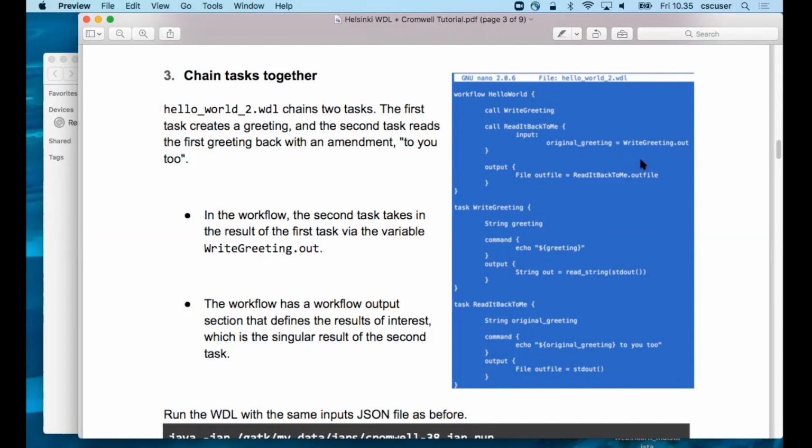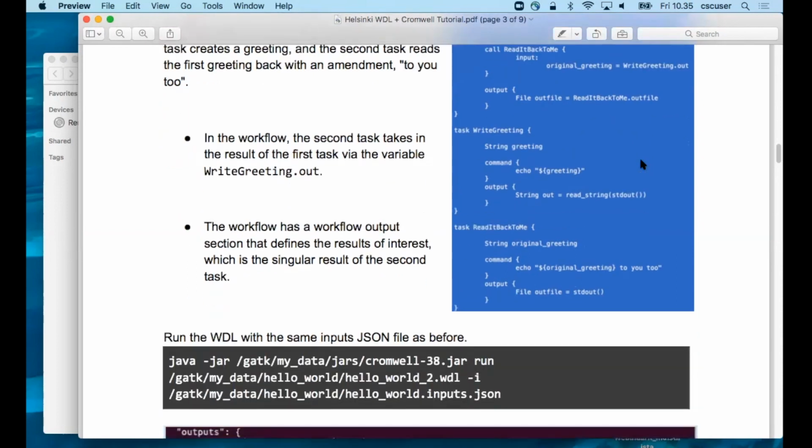You can run multiple commands within the same task. That is possible. It really depends on what you're doing. In some cases, it makes a ton of sense. If there's a tiny little thing you want to do before the next step, it definitely makes more sense to put those commands within the same task, because there is some overhead to running things as multiple tasks. But in some cases, it's really about how long it is going to run and how different they are in terms of, for example, the amount of memory and CPU that they use.